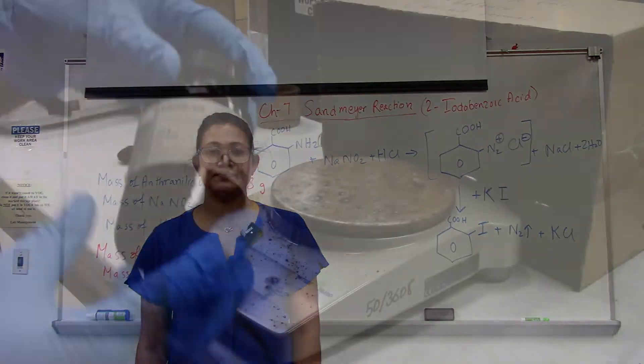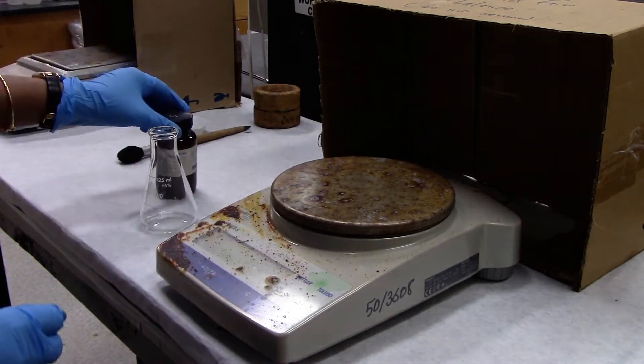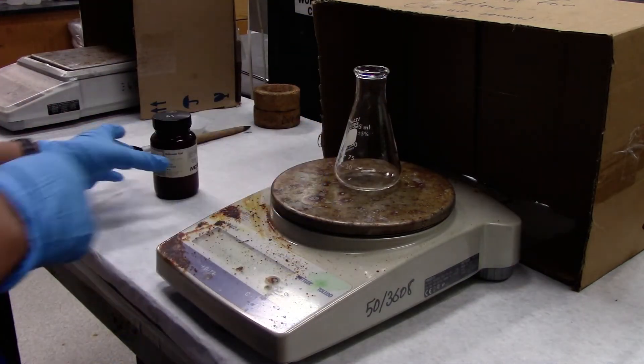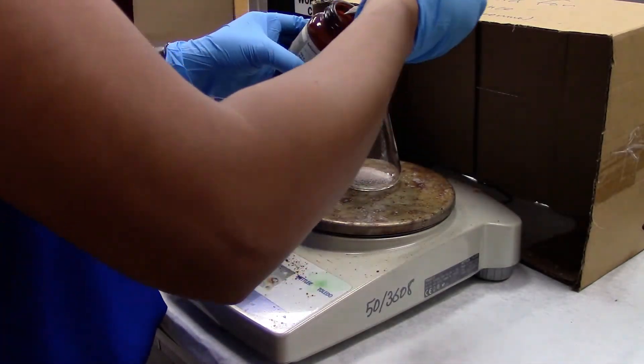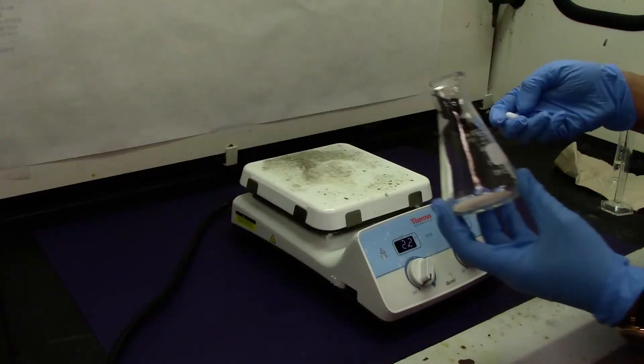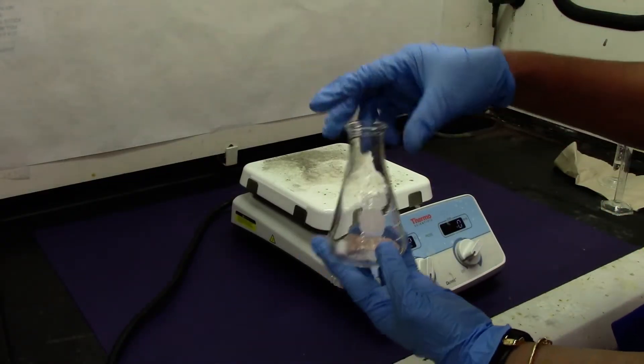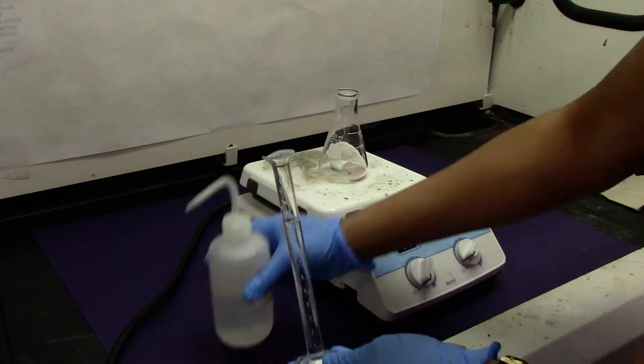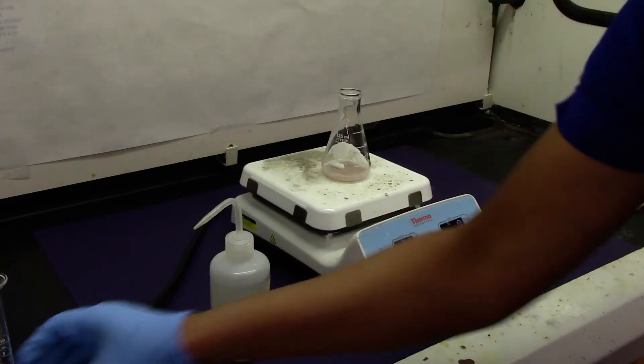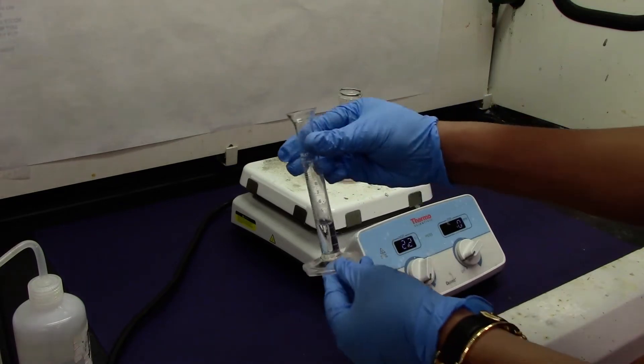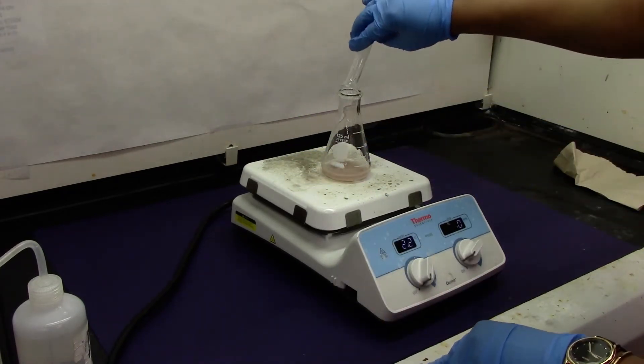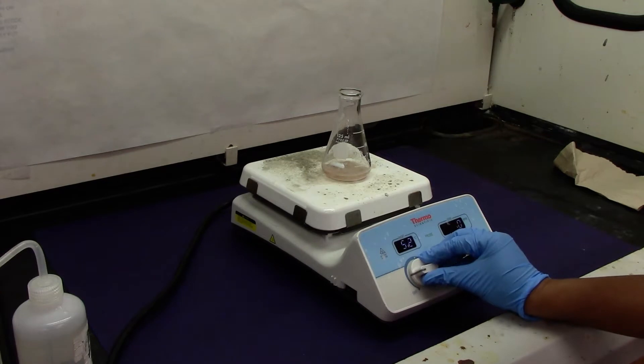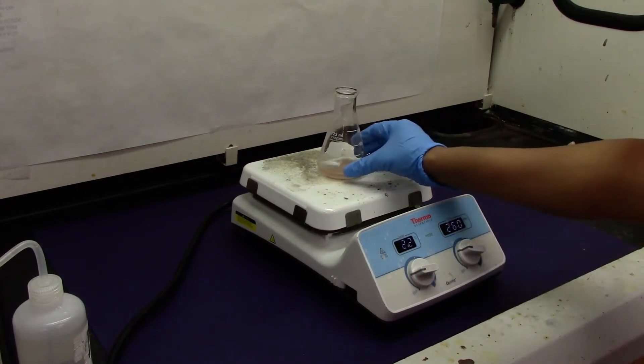Let's go ahead and set up the reaction. We'll start with measuring anthranillic acid. I'm using a 125 mL Erlenmeyer flask. We'll tare the Erlenmeyer flask to zero. To my flask I'm going to add a stir bar. I need about 10 milliliters of DI water added to anthranillic acid, and then I have 3 milliliters of concentrated hydrochloric acid. Once we add all of these we will gently start heating and stirring to make it a homogeneous solution.